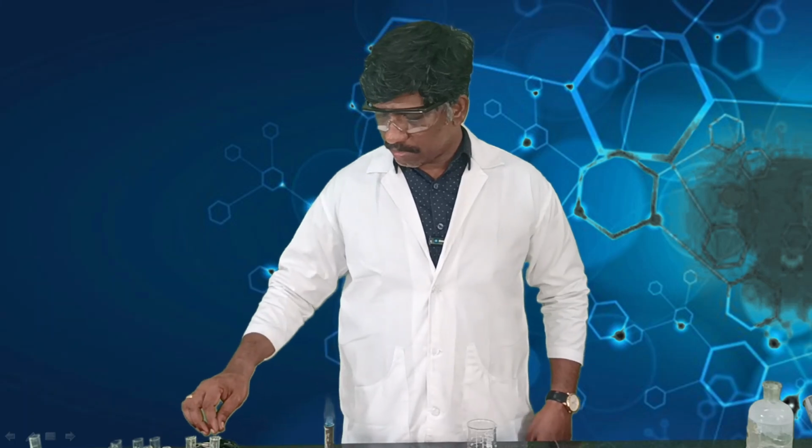Once you detect the presence of some functional groups, you have to confirm it by doing some more experiments. Okay, in that, now we are going to see the confirmative test for dicarboxylic acid. When you get a positive result in the preliminary test for acid, you have to confirm whether the functional group is monocarboxylic acid or dicarboxylic acid. I am going to perform a test called the fluorescence test. From that we shall confirm whether the compound is monocarboxylic acid or dicarboxylic acid.